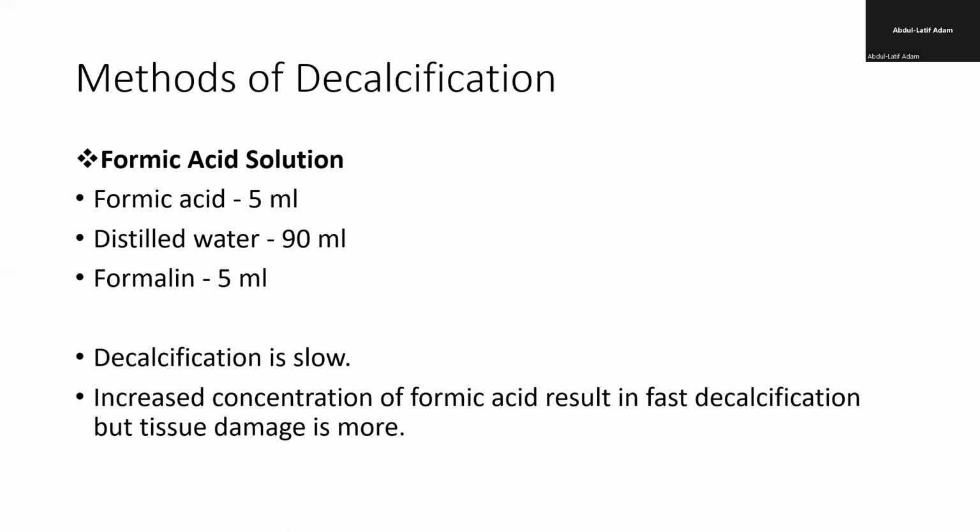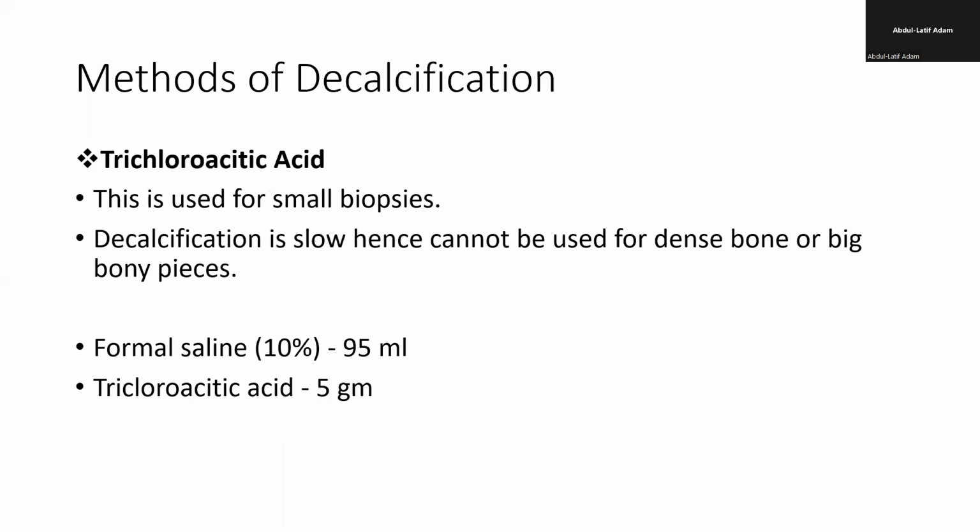Okay, but sometimes you would want to increase. So usually you use it at 5%, but occasionally you can increase the percentage to about 10%, but ideally it is 5% that is used, because if you increase the concentration, it might cause distortion to the tissue.